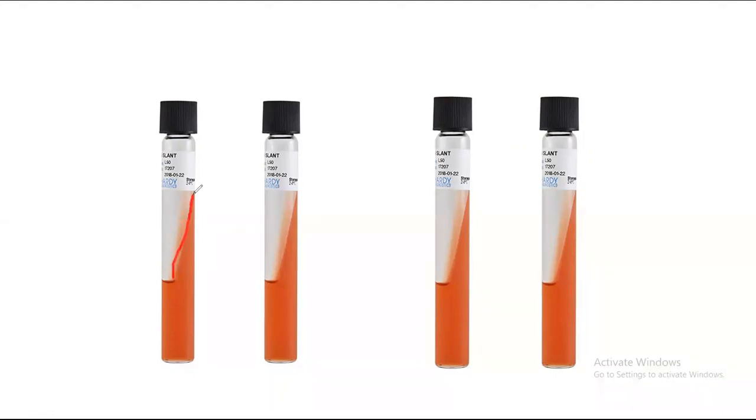So if you pour the media and after that you place the test tube in a slanted way, these slants are produced, and these slants are very important for the biochemical tests of the TSI. When the media solidifies, it produces slants. So these are known as slants.